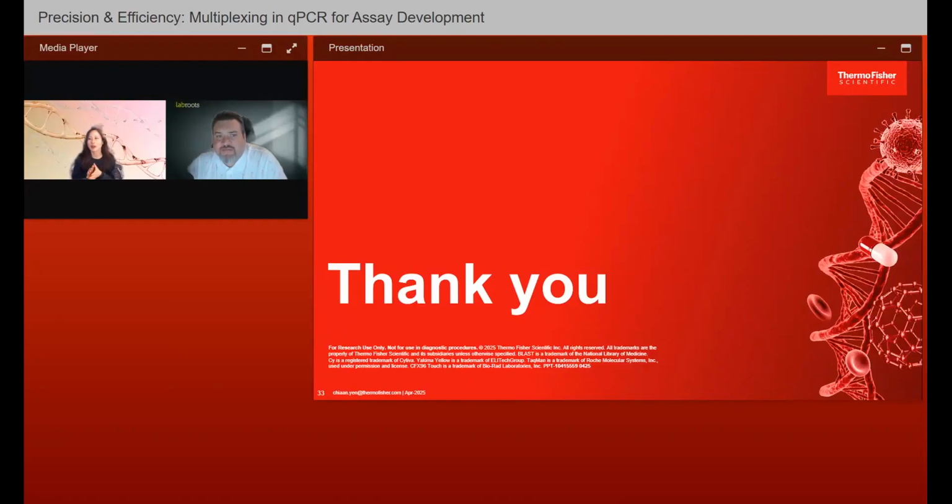That feels like a trick question, but it depends on the context, right? You'll have to look at the application and your sample type, because some sample types are a lot easier or cleaner to amplify from, so then you won't care about the inhibitor tolerance capability of the master mix. You can look for something that doesn't specifically advertise for that, but for sure you would want something that can claim at least up to 2 targets, which I believe we have a lot. Most of our master mixes are capable of doing 2 targets.